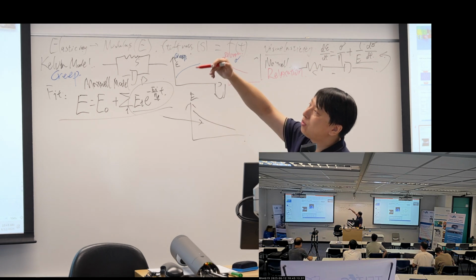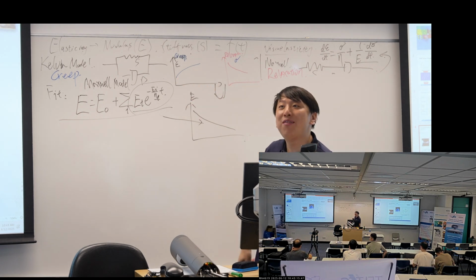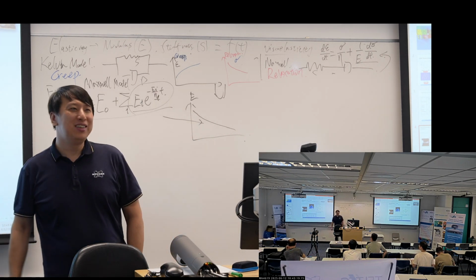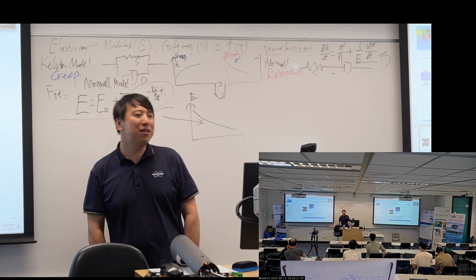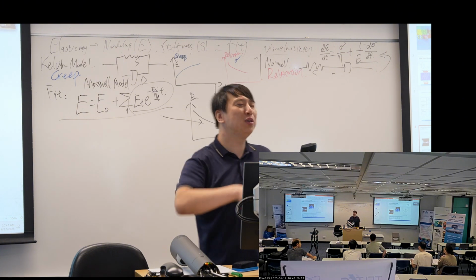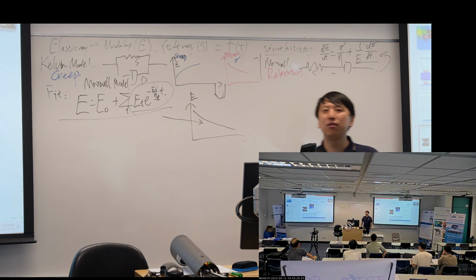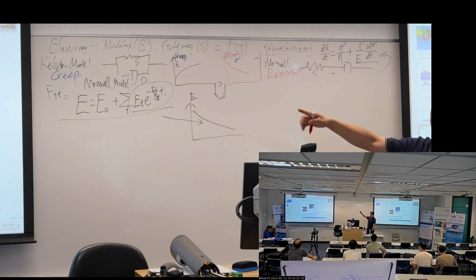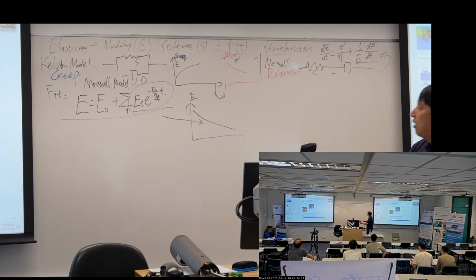And once, do we have a diamond probe? No, yeah. This one is really expensive, and it is not widely used. Not only due to the reason of money, it's just due to the principle. The AFM is a little bit different from that one.